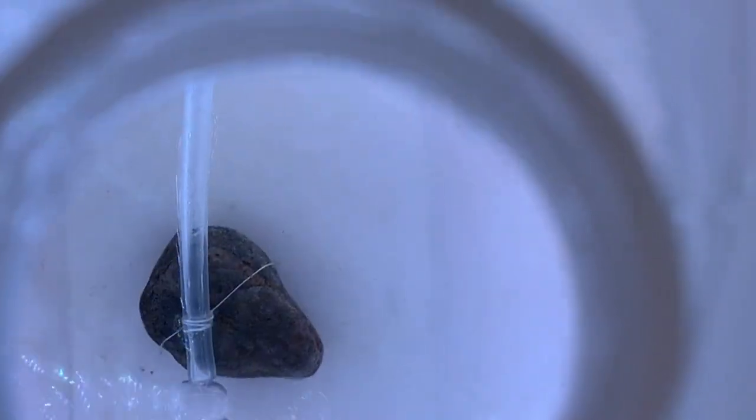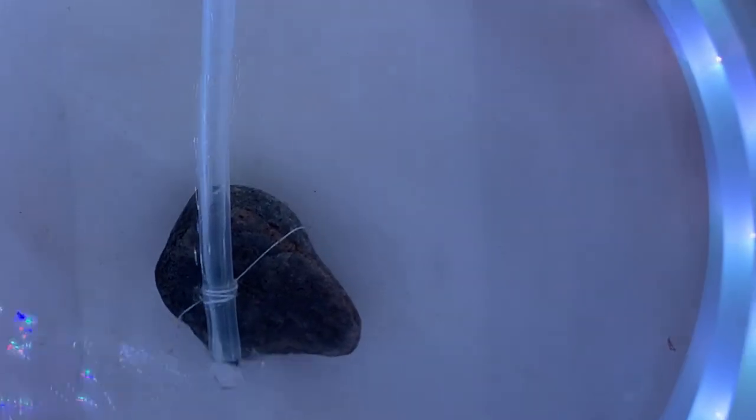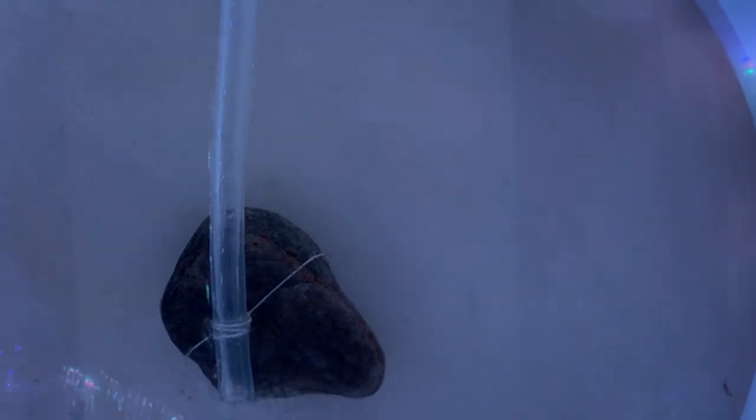And the last thing I did was to connect the bubblers to the bottoms of the bioreactor instead of how they were floating at the top. If you look closely at the bioreactors, you can see that the bubbler tubes, the part that push air into the bioreactor, are now actually at the bottom. I weighed them down with rocks, and they're at the bottom of the bioreactor so that air can actually circulate all the way up through the water, through all the algae, and up to the surface, which is a lot better for circulating carbon dioxide, which the algae really need.